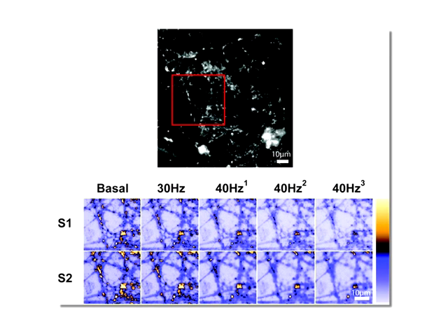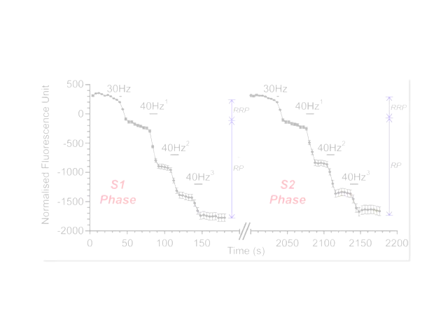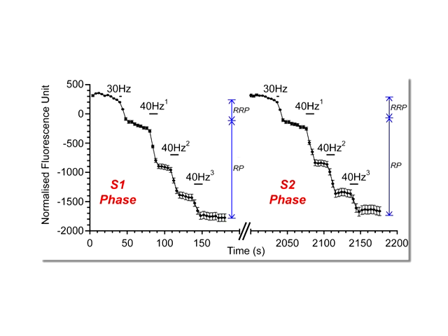And these are the images of the nerve terminals at selected time points. These images are presented in pseudocolor to illustrate the changes in fluorescence as the different synaptic vesicle pools were depleted. Finally, here are shown the normalized fluorescent units of these 90 nerve terminals in S1 and S2 phases. The fluorescence drop of each sequential stimulation can be measured and compared between S1 and S2 phases. In this control experiment, both S1 and S2 resulted in the same sizes of the readily releasable and the reserve pools.